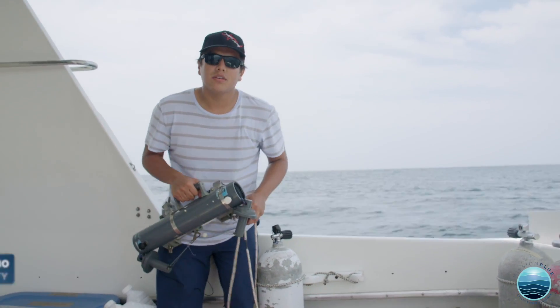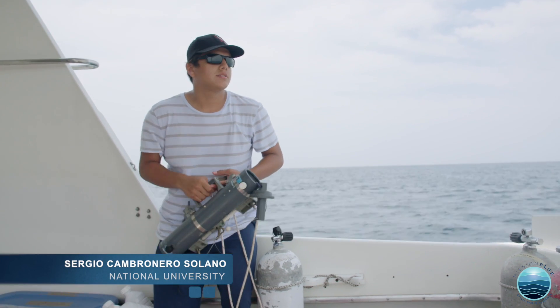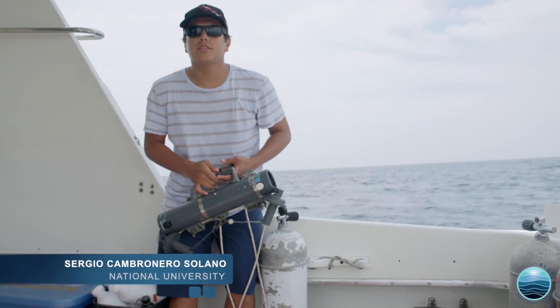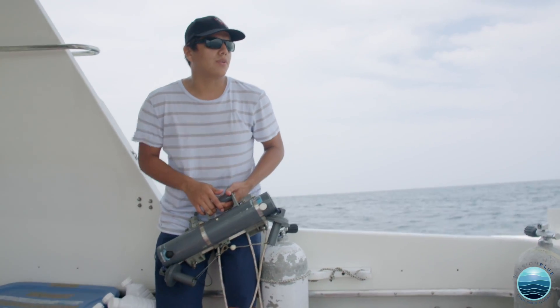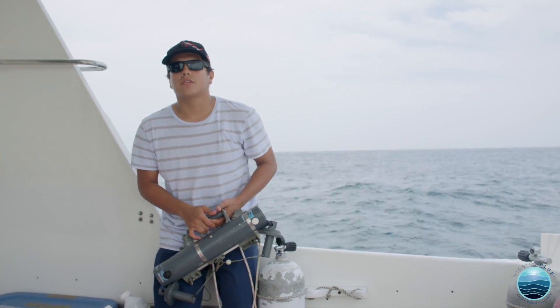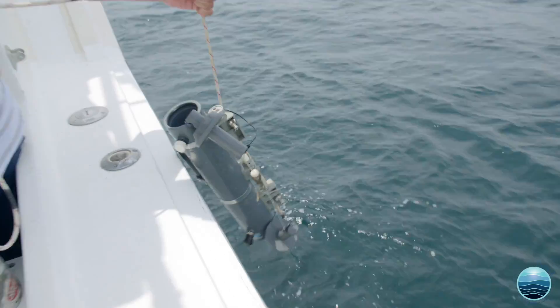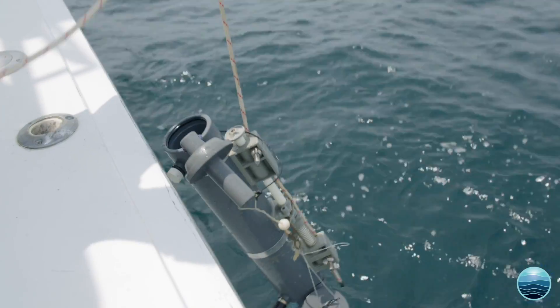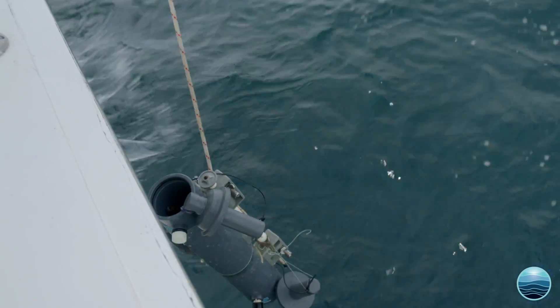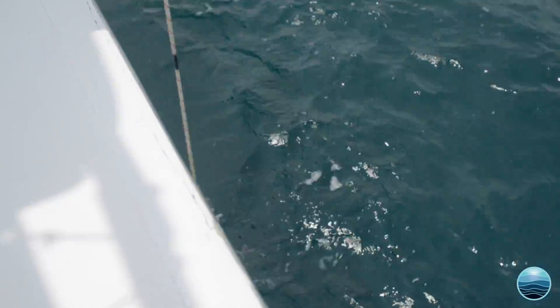This is an Iskin bottle, and we use it to get water samples from a certain depth. Since we're in the dome, the thermocline means the cold waters are more on the surface than other places. So we're sending this bottle to get water samples from 50 meters to characterize the phytoplankton community and to see which species are characteristic from this place.